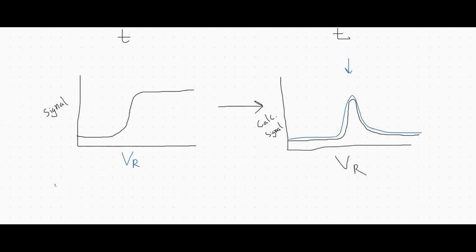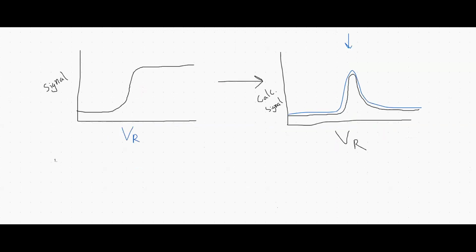But if you're running chromatography, you've also seen something like this. On the left, our phase transition plot. This might show up in your chromatograms if you're going from a low salt buffer to a high salt buffer. You see that kind of step change there. And as we saw above, what you can do is take the derivative of this function and you'll get a curve that looks like the pulse function. It's really that easy.